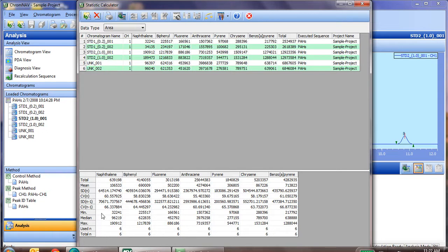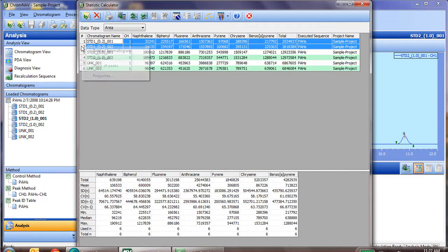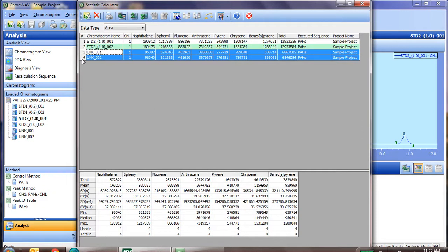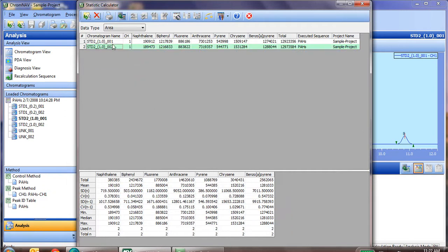So thus, of course, our relative standard deviation is going to be very poor. So, if we go ahead and remove some of the chromatograms, leaving only the like ones, or the ones that have the same concentration, now we see our relative standard deviation is very good for those two standards.